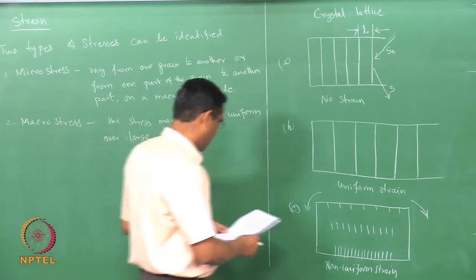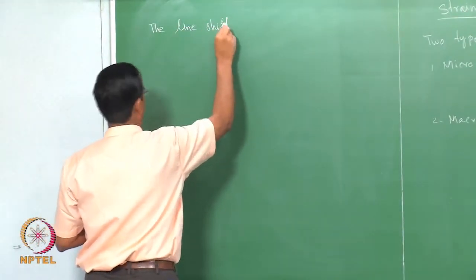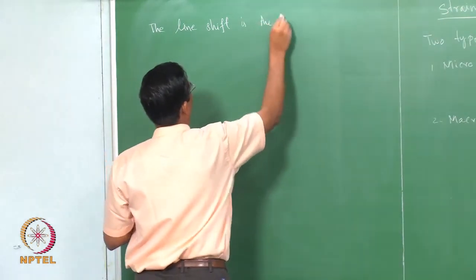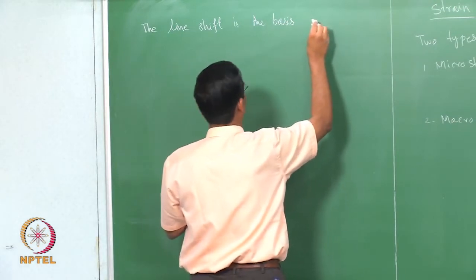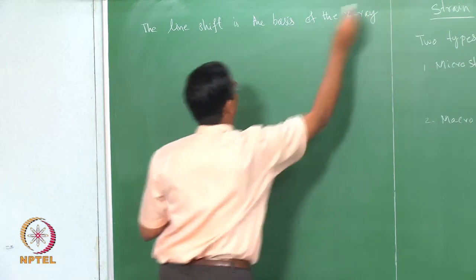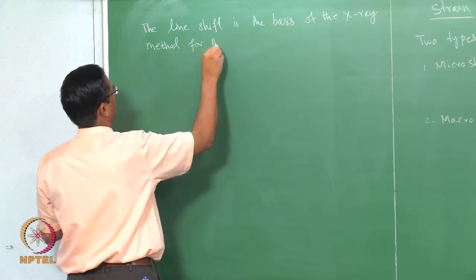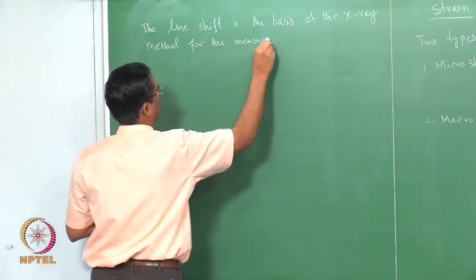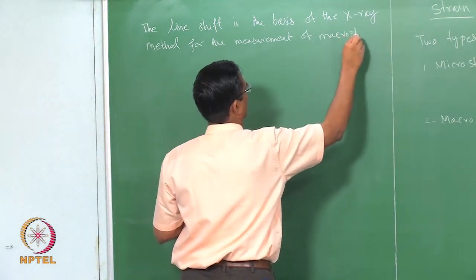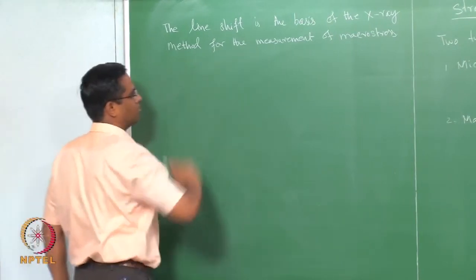So, the first point to note down here is that the shifting of the line is the basis of the X-ray method for the measurement of macro stress.